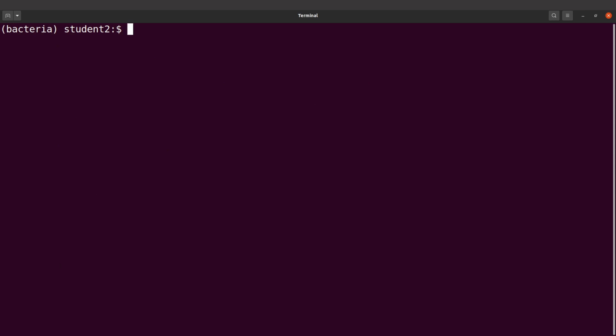All right, so let's do an ls to take a look at the file again. There's the file. Now the file we have here, what you should take note is that this file is uncompressed. Normally, FASTQ files come in a compressed format, i.e. the .gz format. So that helps us to save space. But for this tutorial, we are going to use the uncompressed one here. But if you have your file, make sure that it's compressed. That's what I recommend so that you can save space.